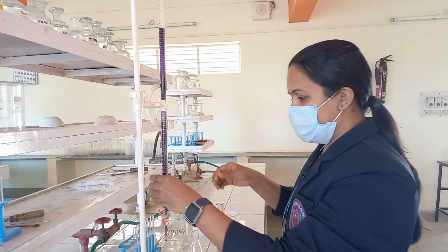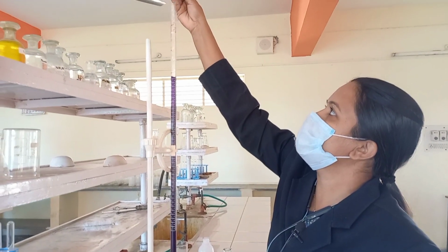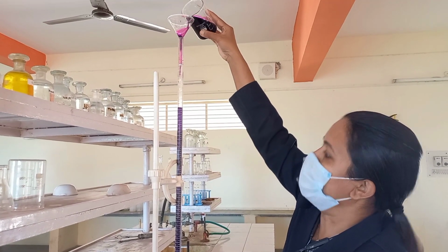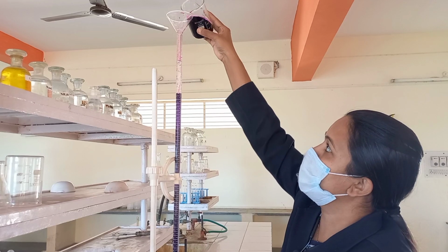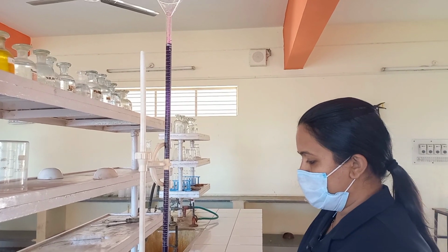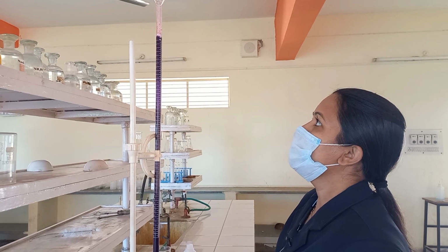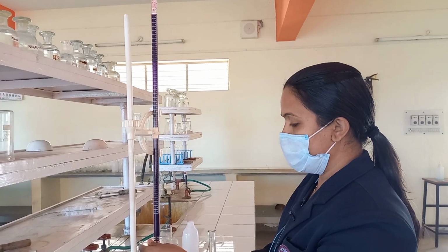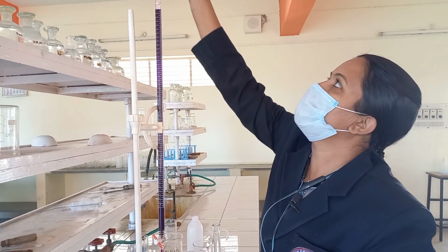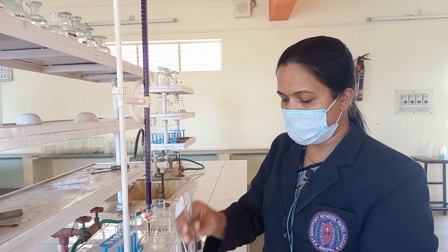Now what you have to do, children, first of all, set up all your apparatus carefully. In this apparatus, this one is the burette. In the burette I am pouring KMnO4, so you have to pour the KMnO4 carefully. After pouring KMnO4, from the jet of the burette, the lower part of the burette, you have to run down the KMnO4 solution and then remove your funnel. In this manner you will fill your burette with KMnO4.